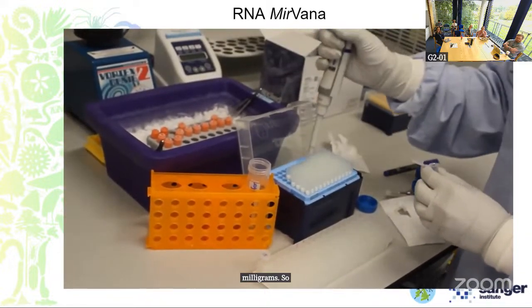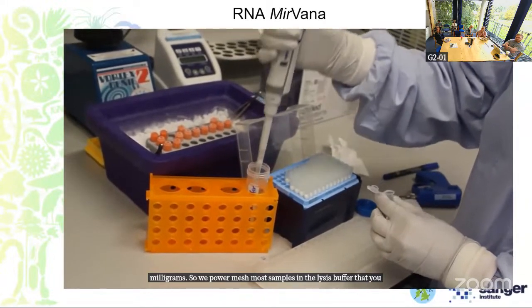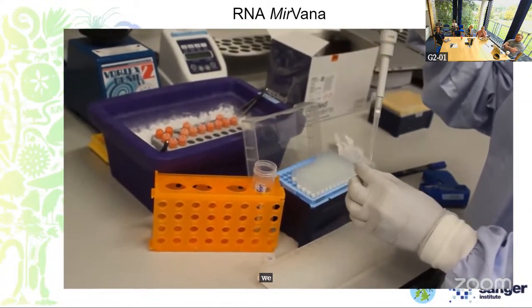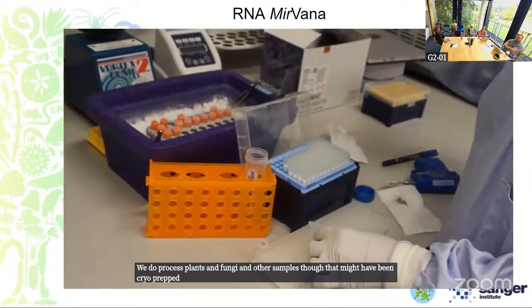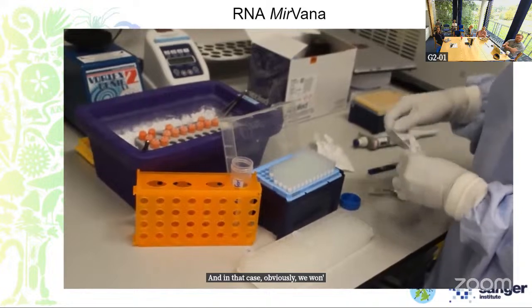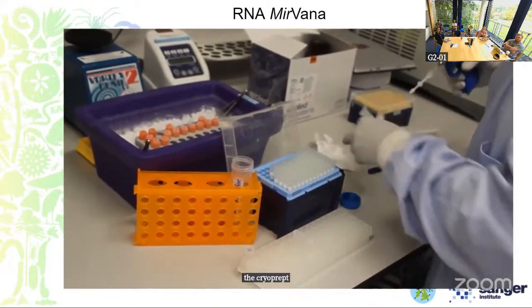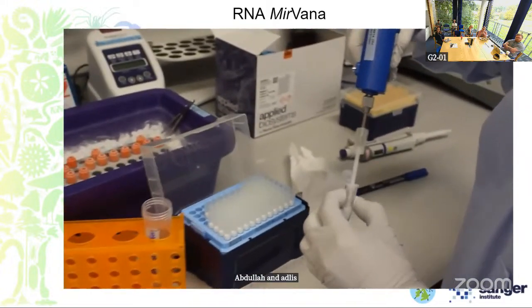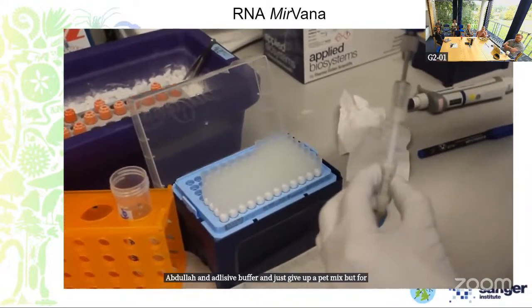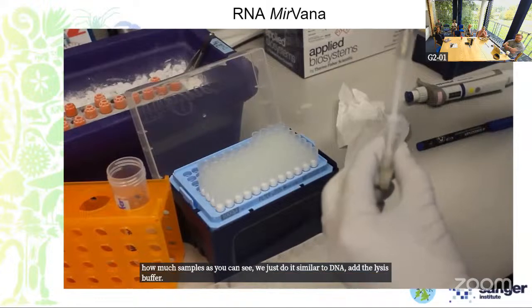We power mash most samples in the lysis buffer that you'll see here. If we do process plants and fungi and other samples, though, that might have been cryo-prepped, in that case, obviously, we won't power mash. What we'll do is we'll just transfer the cryo-prepped tissue into an Eppendorf tube, add the lysis buffer, and just give a pipette mix. But for power mash samples, as you can see, we just do it similar to DNA, add the lysis buffer, and mash the tissue.